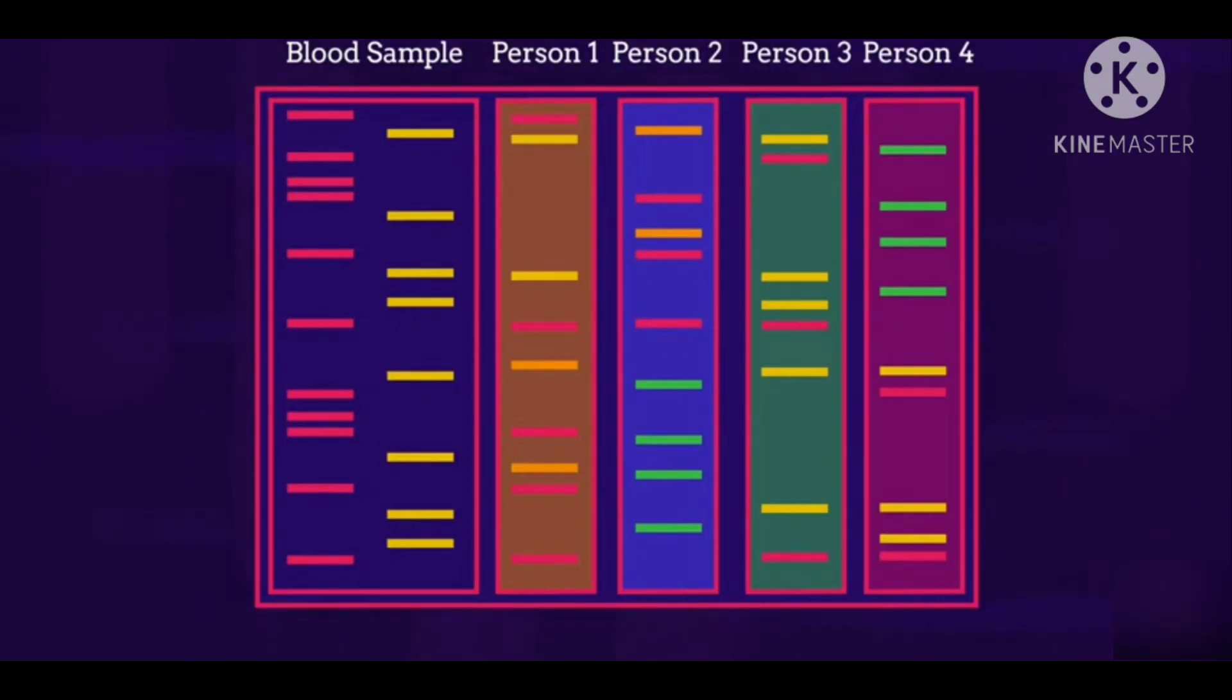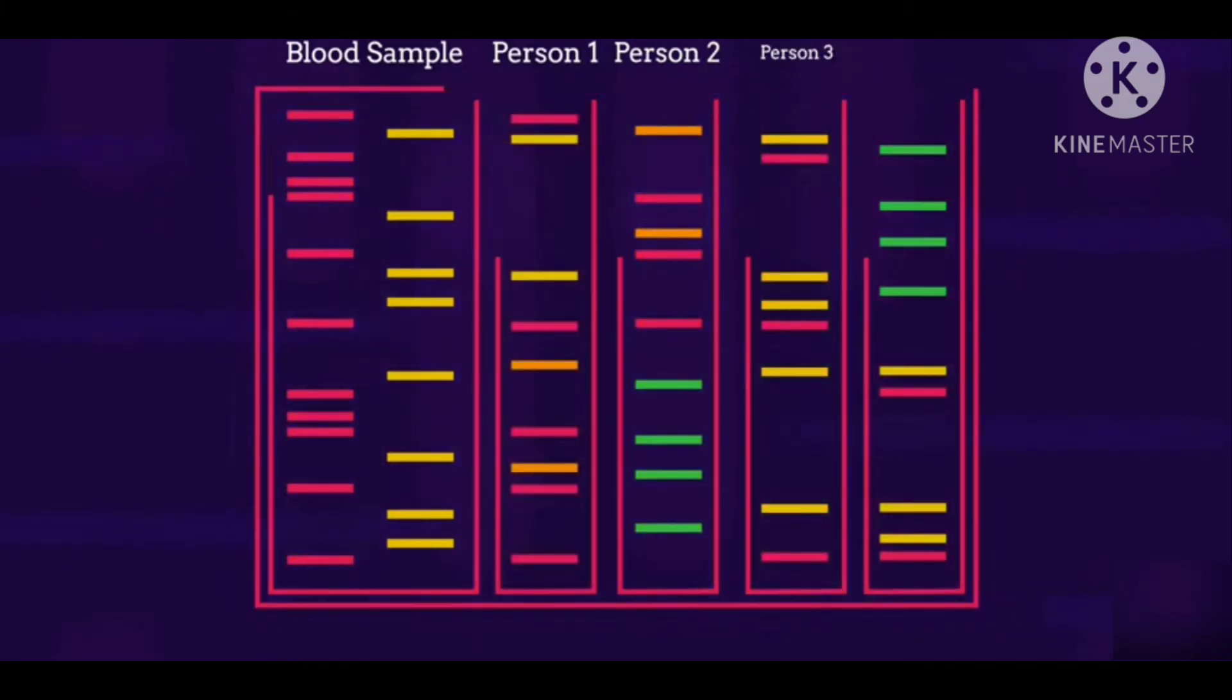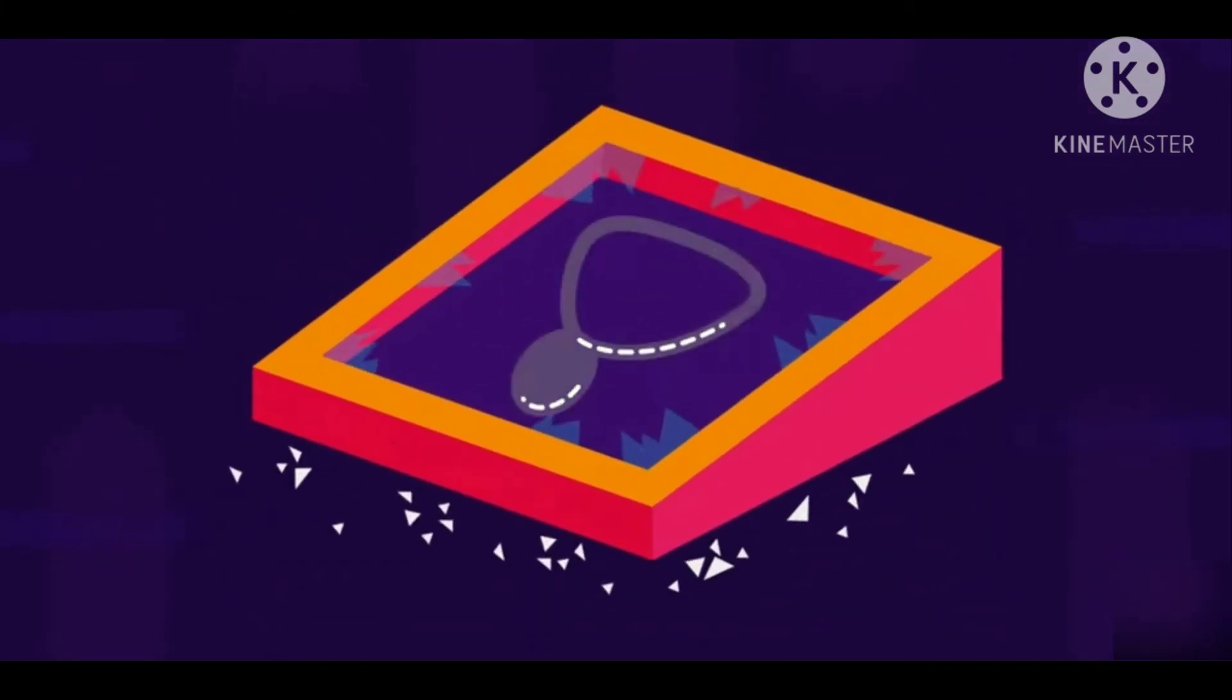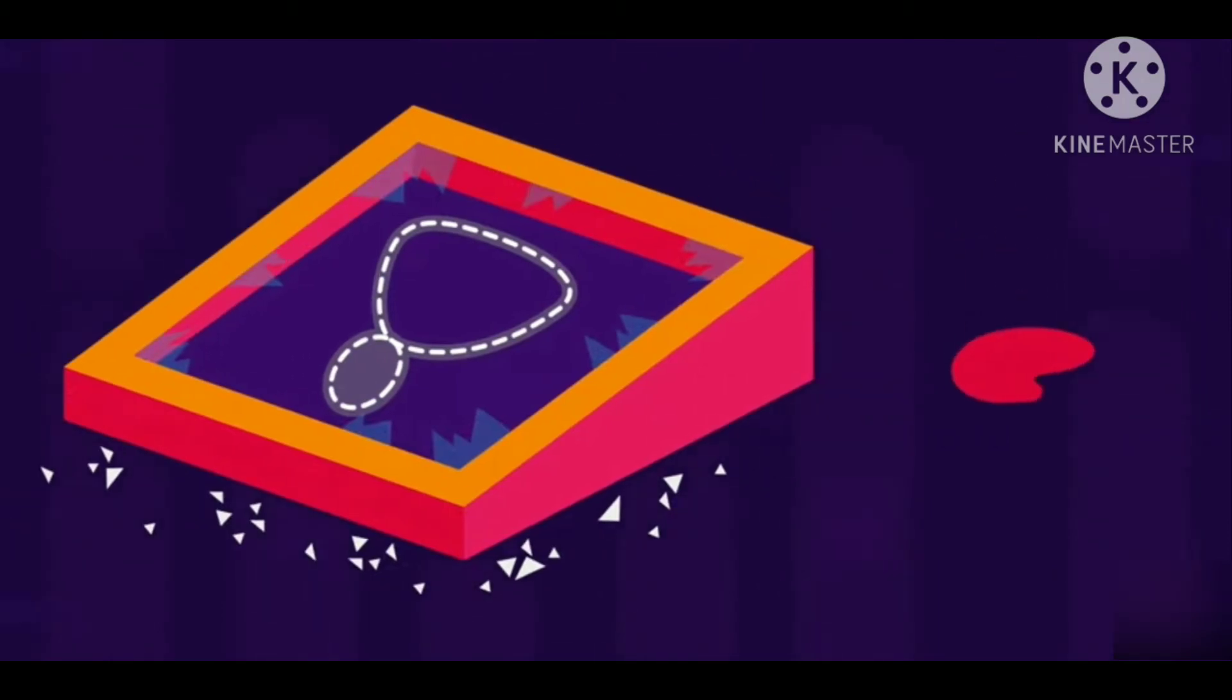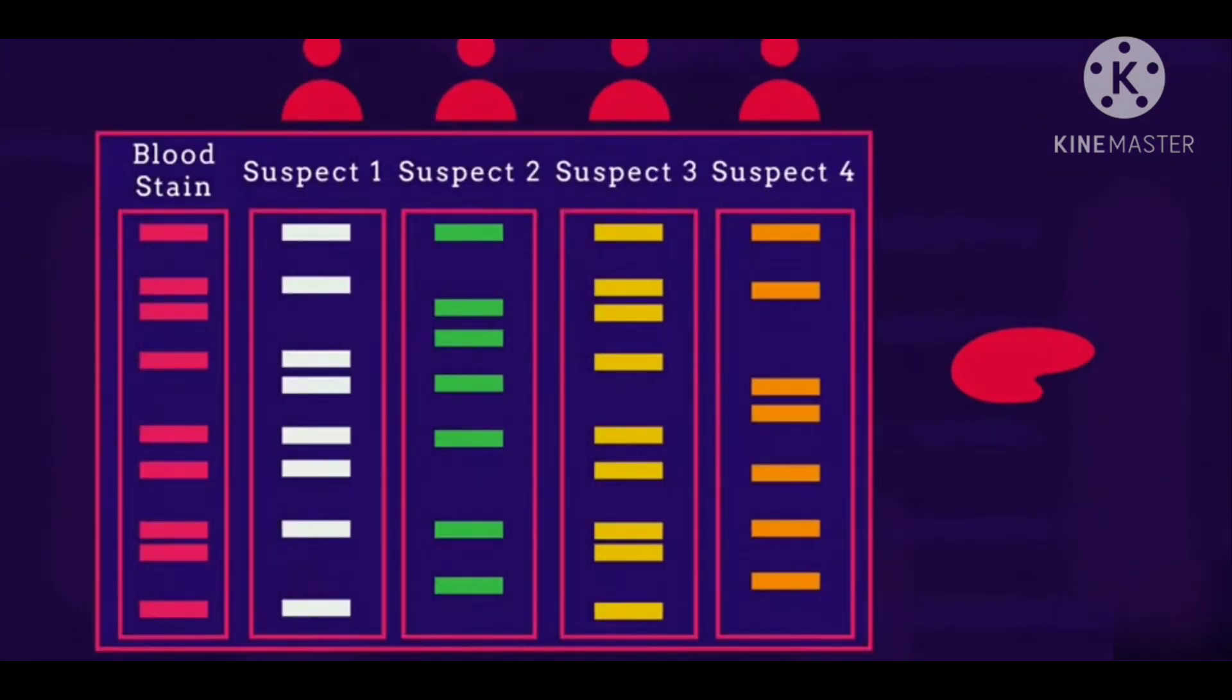So let's have a go at using DNA profiles to solve some mysteries. An item was stolen in a burglary. A drop of blood was left behind by the thief. Samples of DNA were taken from 4 suspects and compared to the sample left at the crime scene. Which suspect is guilty? Here's a clue. Look for the one that is most similar to the one from the crime scene. Pause the video while you decide.